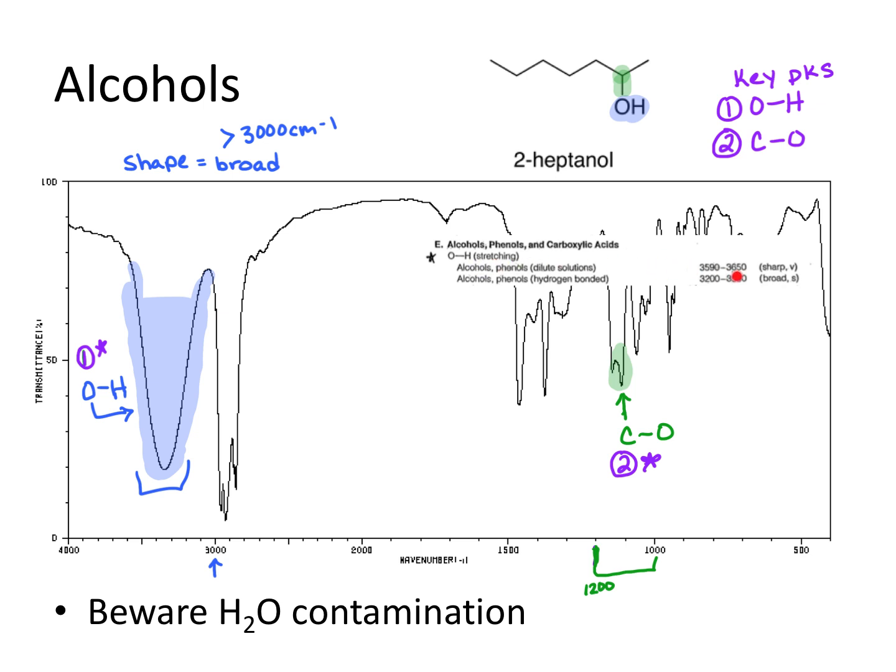Now, again, just as a reminder, you're going to get those numbers from the chart that you're given, the handout. So I put right here the little piece of the chart with the OH, for example. So if you look here, it says OH stretching, that's the OH bond, right? And we're going to use this number here where it says alcohols and phenols, that's 3,200 to 3,550, right? And that's within this range because it's right here, right? So then that's how we know it's right. So again, you'll have the handout. I won't show you every time, but I just wanted you to remember to correlate those to the chart so you don't have to memorize the numbers.